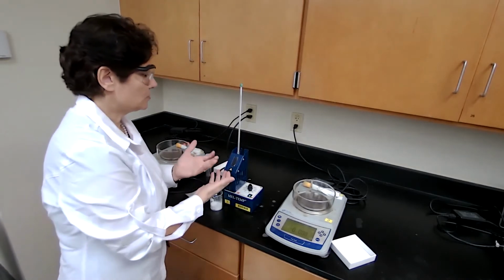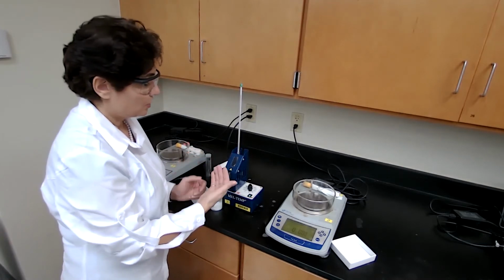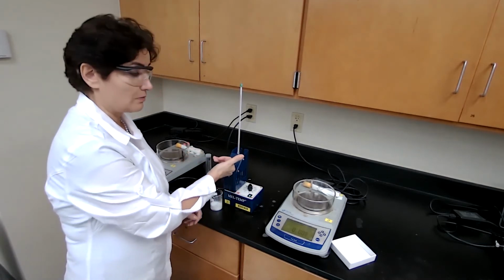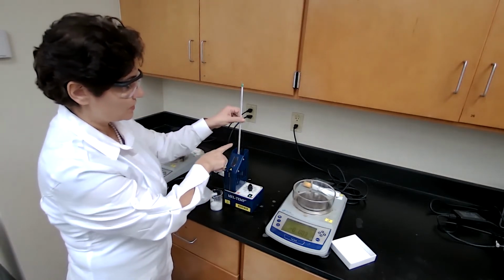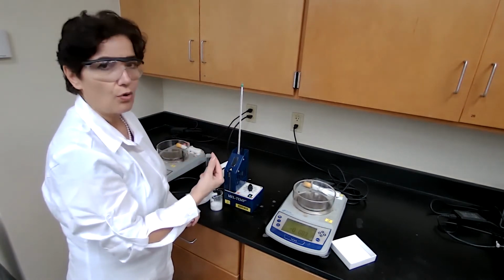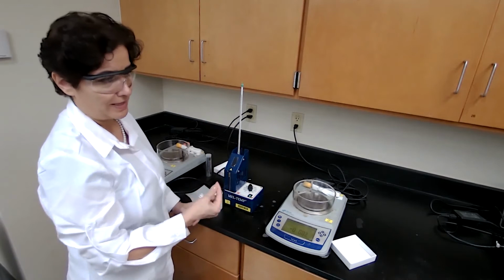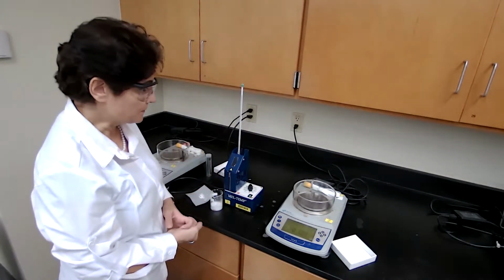So I'm going to stop the recording at this point and pay attention to the melting, but I will take a picture of the temperatures for initial and final melting for you to record those numbers as initial and final, so you can use them for your lab report.